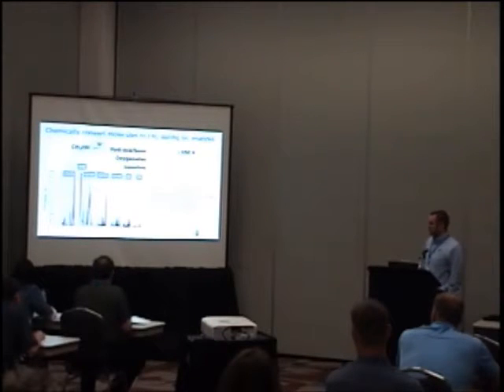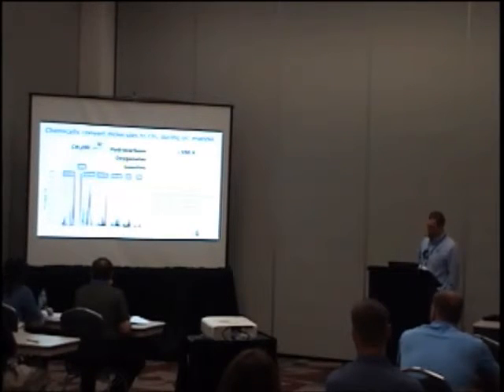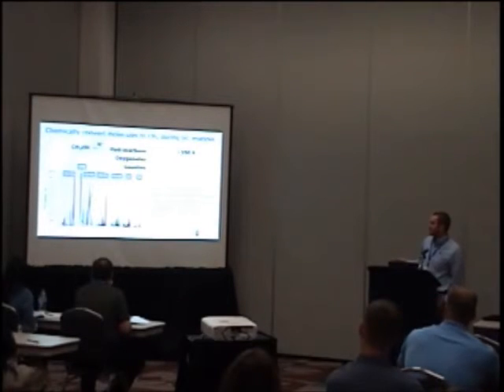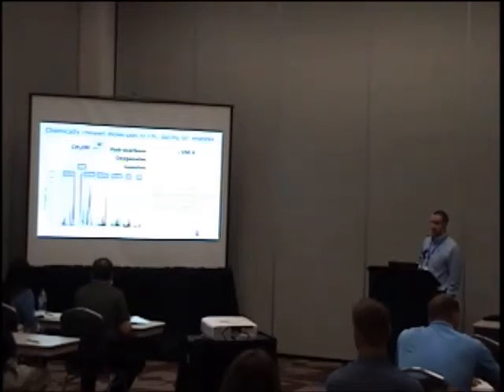So this blue line, which might be hard for some of you in the back to see, shows the new FID signal now that everything has been converted to methane. So now the signal here is directly proportional to the carbon content of each compound. Instead of calibrating each peak for the individual type of molecule, now all we need to do is integrate the peaks. And that gives us the relative carbon amounts of each of these different components.